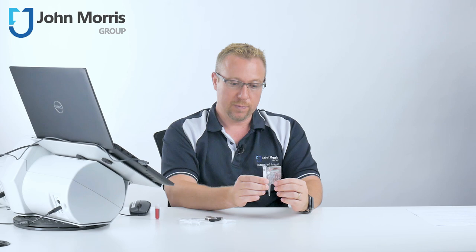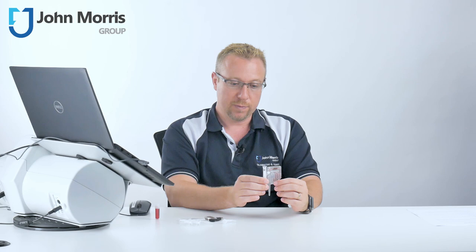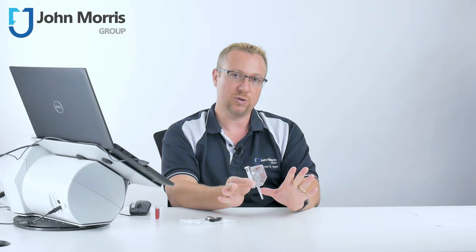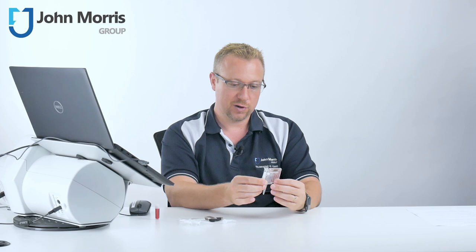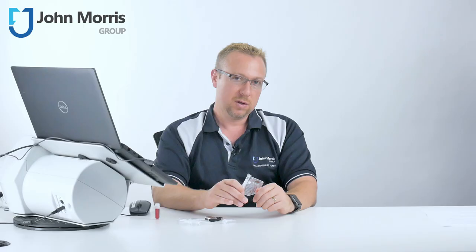So coming back to the cassettes for just a moment. There's no sharp edges. It's a simple polycarbonate plastic with no dangerous chemicals. Unless your cell line is a biohazard, they're easy to dispose of. For complete traceability, we have lot numbers on them, and we always carry these in stock, so you don't have to worry about running out.